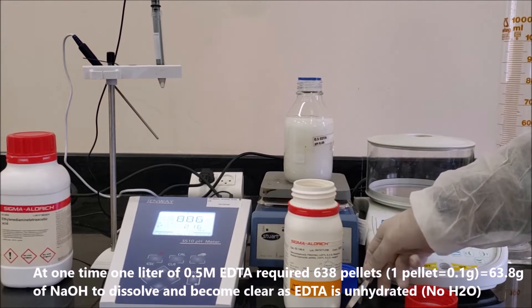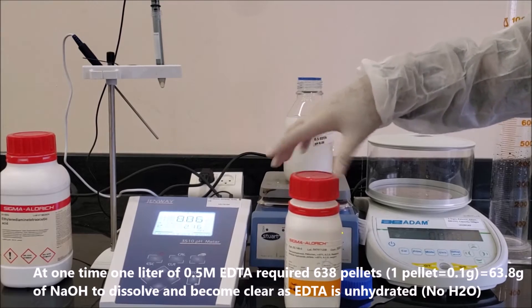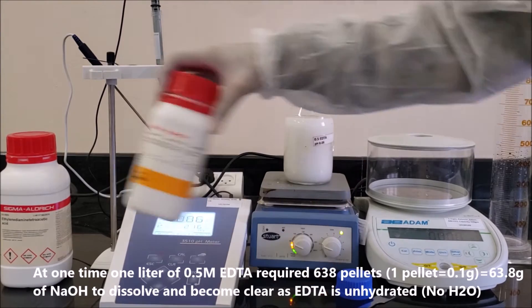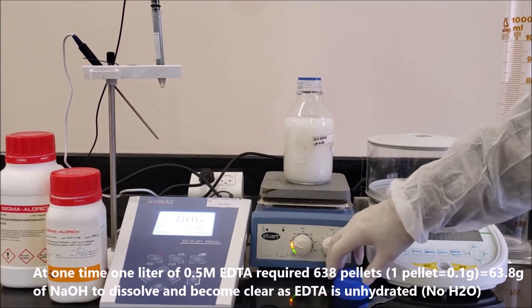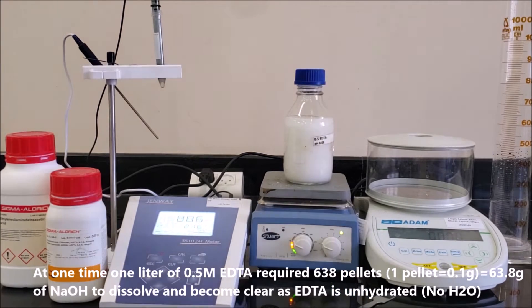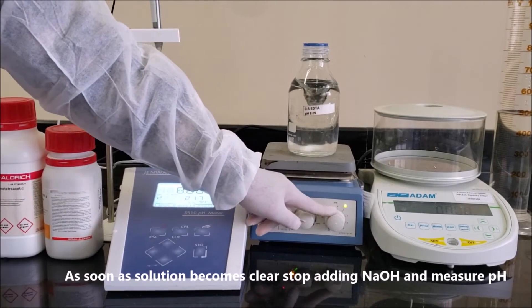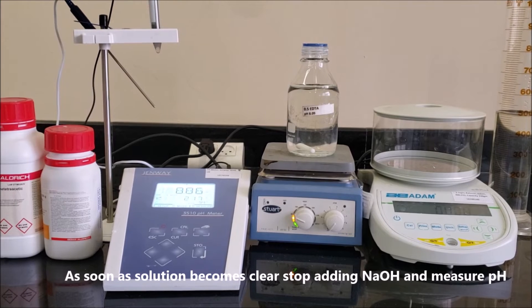Note that 1 liter of 0.5 molar EDTA requires 638 pellets in total. One pellet equals 0.1 gram, so in total 63.8 grams of NaOH are needed to dissolve the EDTA and make the solution clear, as EDTA is anhydrous (no H2O). As soon as the solution becomes clear, stop adding NaOH and measure the pH.